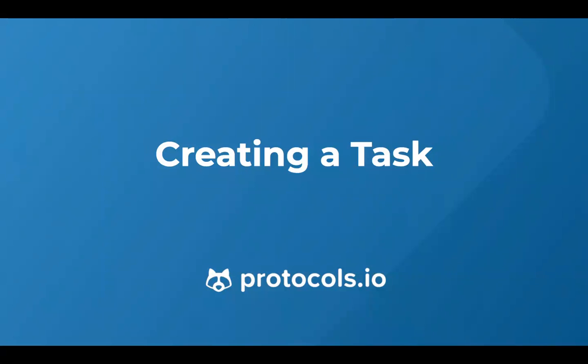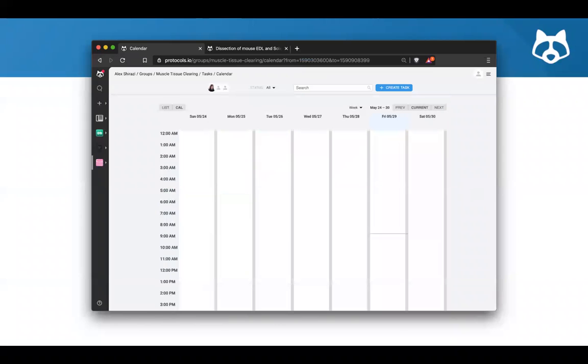Next, we'll go over creating a task. When you first access the Protocols.io task manager, you'll have an empty slate, an empty schedule. Keep in mind that there might be a particular week that you might want to focus on. So you'll be able to just press next or previous to access different weeks within that month. Or you could access the calendar view in different formats.